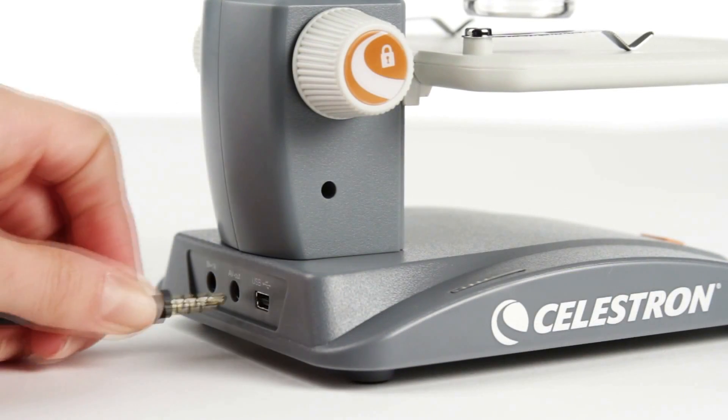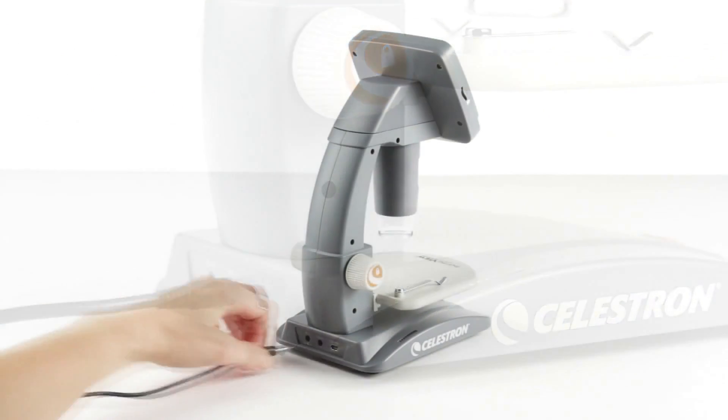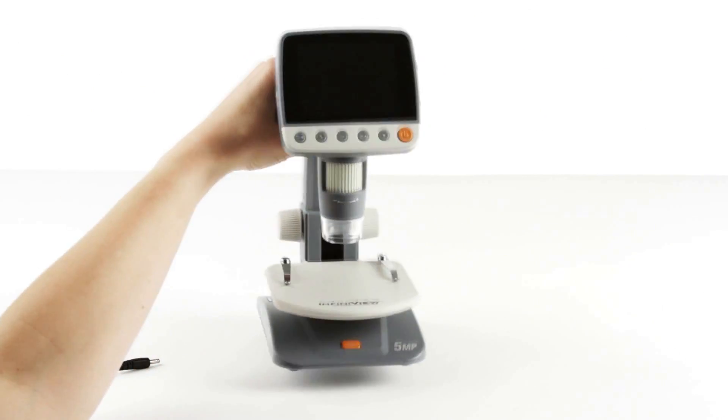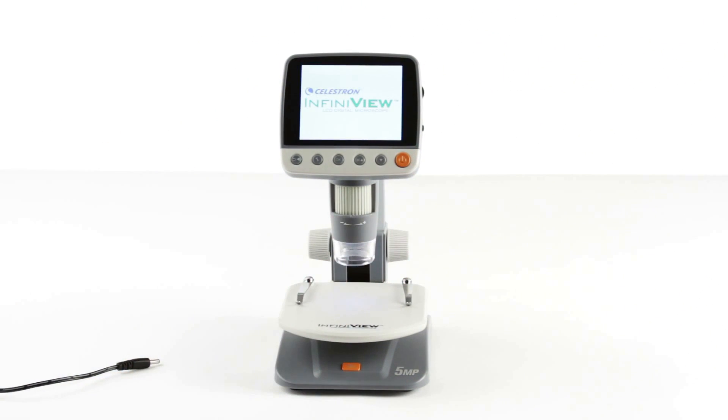InfiniVue also connects to projectors for sharing the view with an entire classroom. This versatile microscope can go anywhere you do — InfiniVue runs on a rechargeable lithium-ion battery for up to 3 hours in the field.